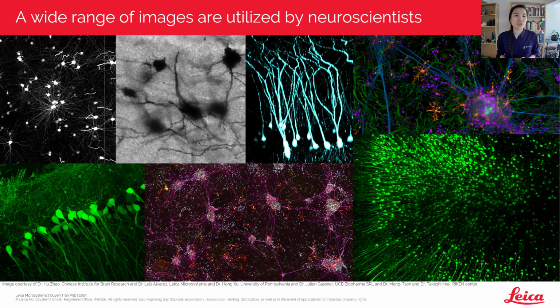This slide is just showcasing a few examples of the type of images and complexities they are working with today. This range in both methodology and networks can make it particularly hard to analyze and understand the neural morphology and biology. So today with Aivia 12, we are adding a few more tools to your toolbox to help you reduce this complexity and to gather additional insights.